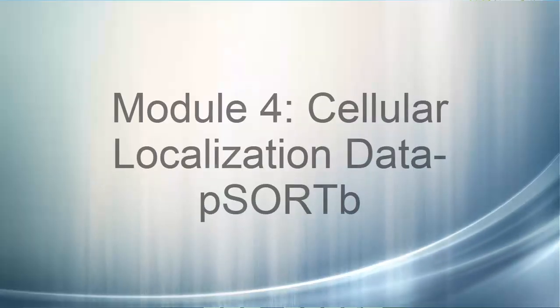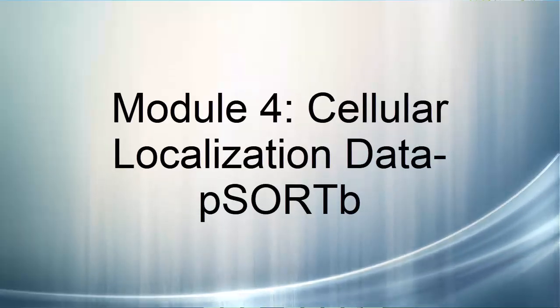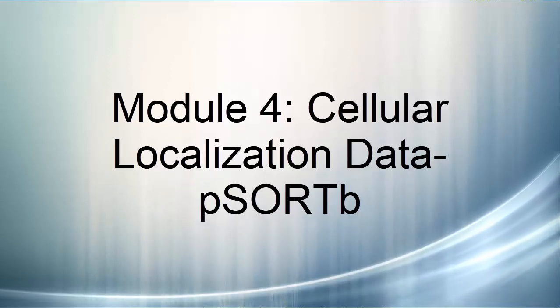Welcome back to Module 4. This tool is called pSORTb. Remember, this whole module is about cellular localization data.